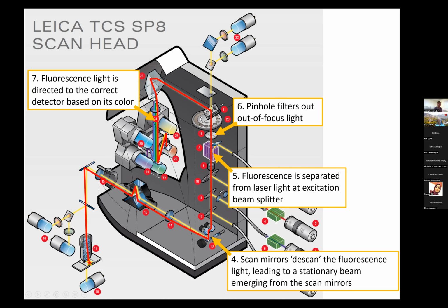That red fluorescence would be traveling the red part of that rainbow spectrum and would end up at the photomultiplier, which is adjusted to detect the red fluorescence. And then of course the fluorescence light is detected by that detector. So that's essentially what I wanted to show you about the technology inside a regular confocal laser scanning microscope.